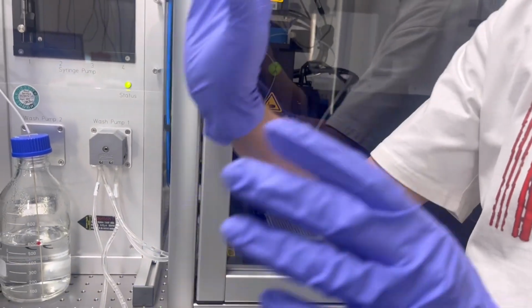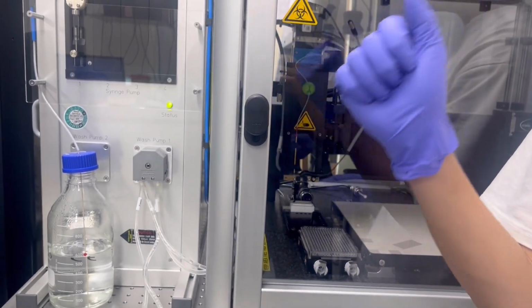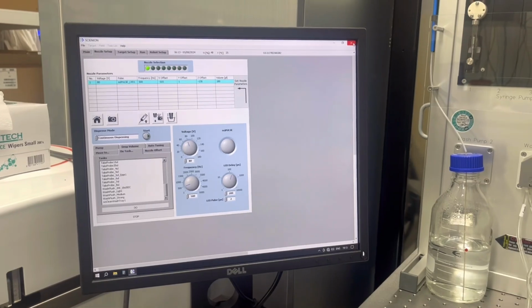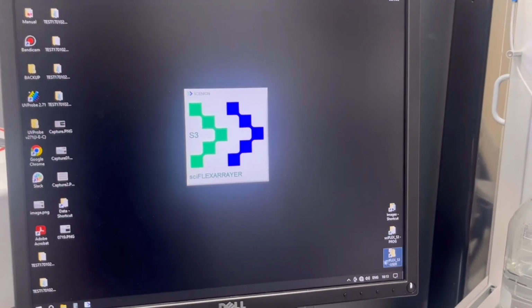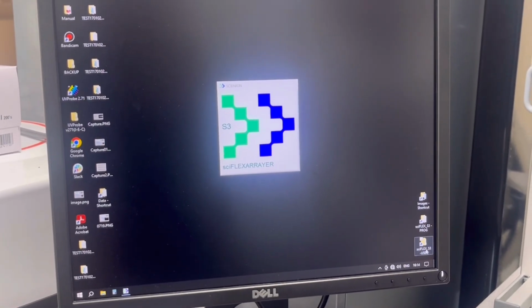Yeah, I think there are many things, so you cannot remember them if you don't do it by yourself. And one more thing is they have the manual.